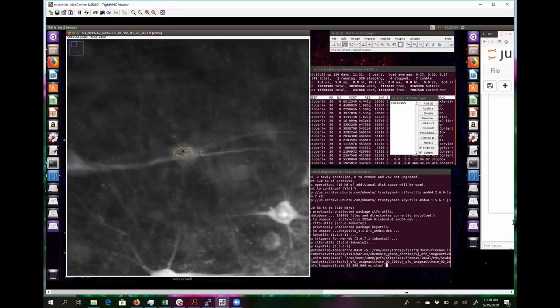So the benefit of this is that now you can actually avoid overlap with other things. So as I said, the benefit is basically you get a more accurate measurement of your cell signal. The cost of it is that now your ROI does not represent the cell.